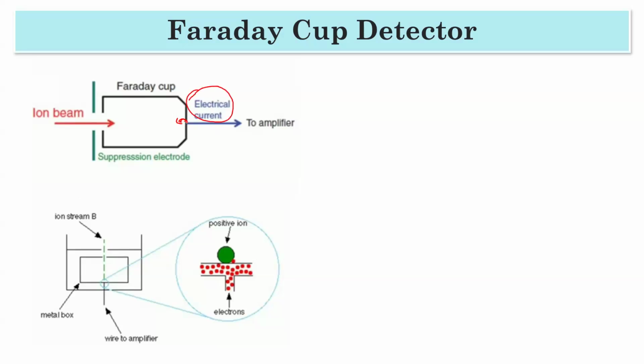Then we amplify that, to measure how many molecular ions have hit, and then you get the signal.